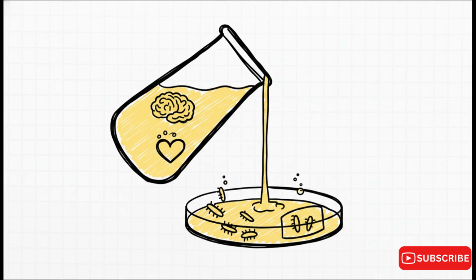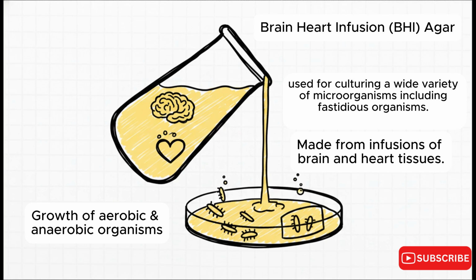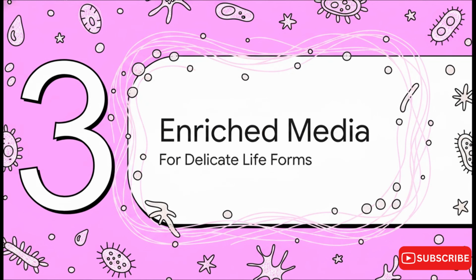Now, if an organism needs just a little bit more care, we turn to brain-heart infusion, or BHI, agar. This medium provides a slightly richer foundation, mostly because it's made from actual infusions of brain and heart tissues. That extra richness allows it to support a huge variety of microbes, including both the ones that love oxygen, our aerobic organisms, and the ones that actively avoid it, the anaerobic organisms. Which brings us softly into Section 3, Enriched Media.